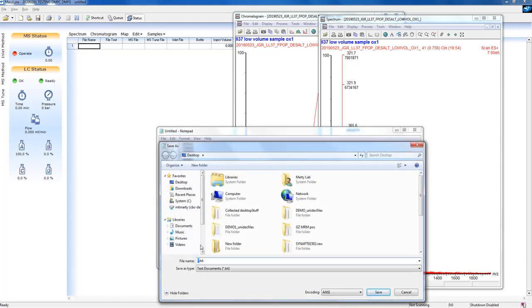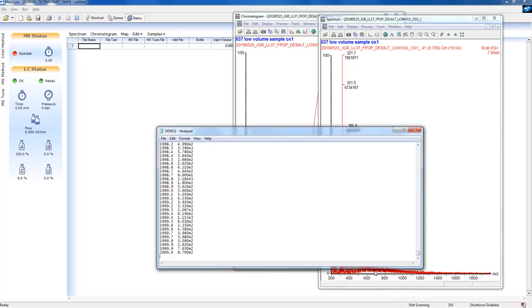Again, you may copy-paste directly into Unidec with Control-G without creating a text file, but a text file allows you to go back and reanalyze your data.